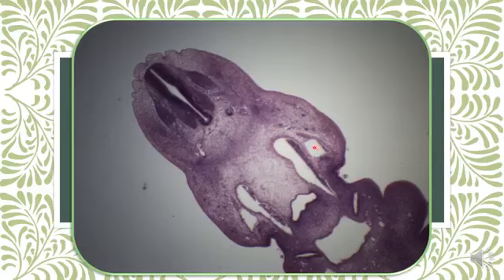Lateral to the dorsal aorta, cardinal vein, and ventral to the dorsal aorta, gut.